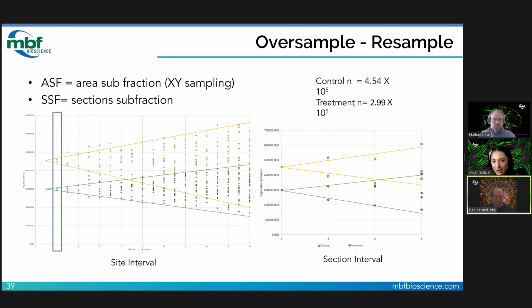Here, I'll put that up on the screen. I think I wanted to play it safe because I know that with the resample dissector, we saw that my new guard zone implementation of a 3 micron guard zone on the top and the bottom is already going to decrease my total cell top counts and my Q minus.